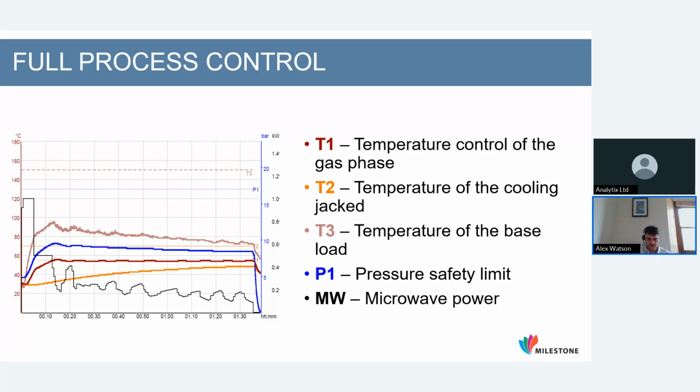That's the sensor that was sitting in the liquid phase. As you can see, we're rapidly bringing that up. That's one of the benefits of microwave power. We're really able to keep things up very fast. We're bringing that to the vaporization point, where it vaporizes and plateaus, as we've got a constant cycle of vaporized C&D reagent.